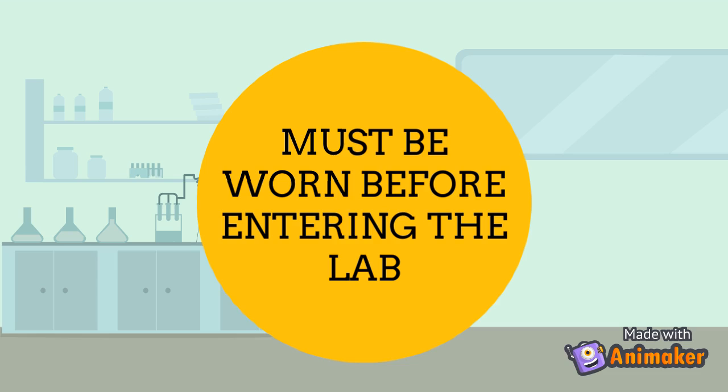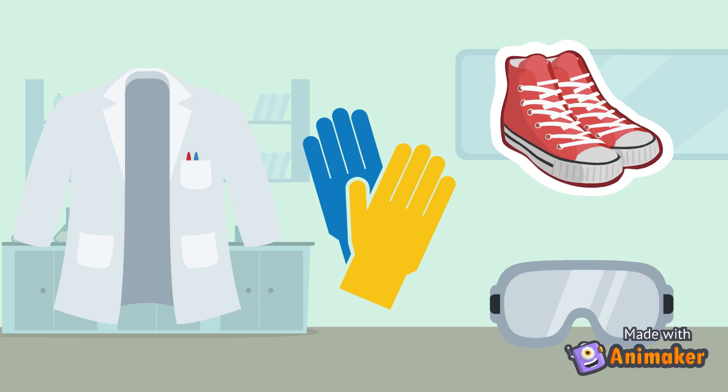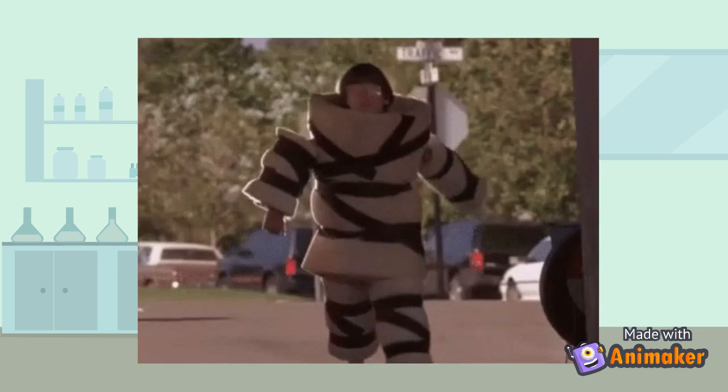In addition, things that need to be worn before entering the laboratory are laboratory coats, gloves, shoe covers, and protective eyewear such as safety glasses or goggles. This precaution can prevent any accidental spills or splashes of hazardous chemicals or cell culture from coming into direct contact with our body.